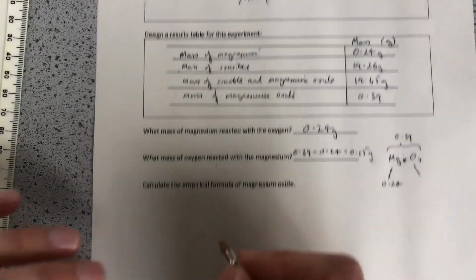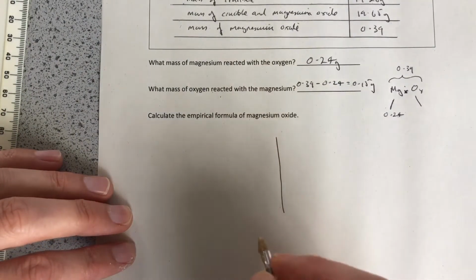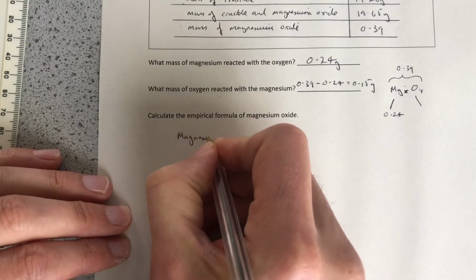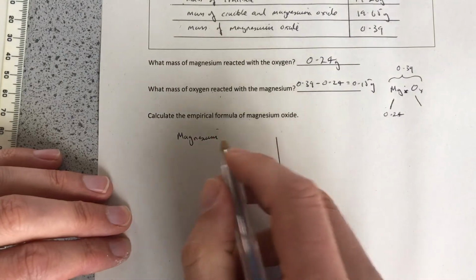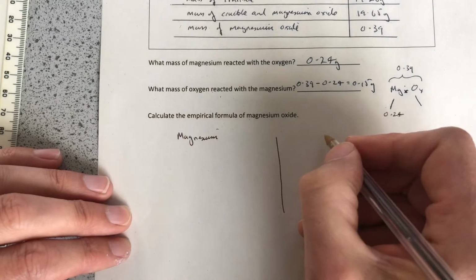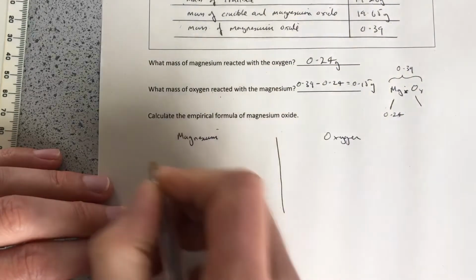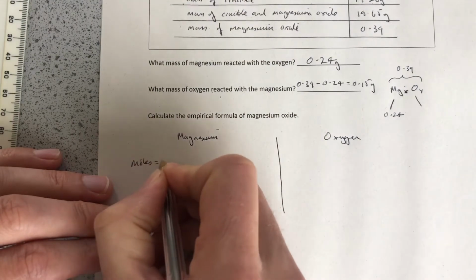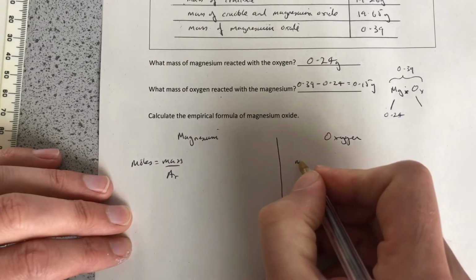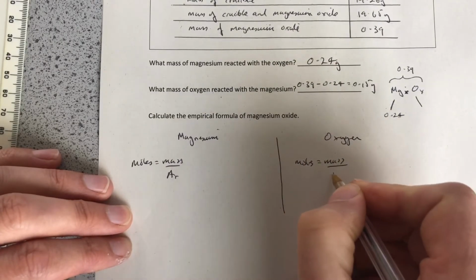Okay, so the empirical formulae. To do empirical formulae, we divide a bit of paper in half, and we write magnesium on this side. Whatever the compound is, we write one part of it on one side and the other part on the other side. So it's oxide, so we're going to write oxygen here. We're going to write moles equals mass divided by atomic mass for magnesium, and moles equals mass divided by atomic mass for oxygen.